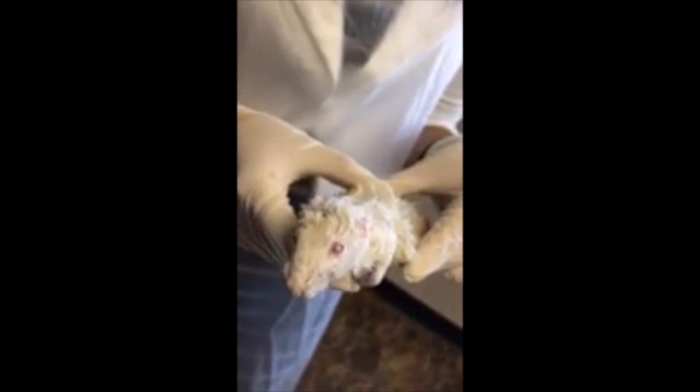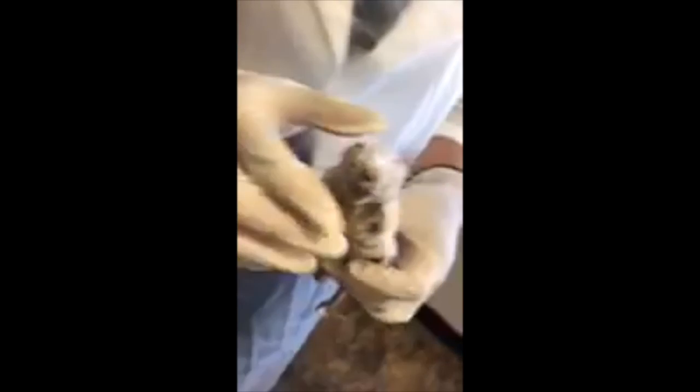Today we will be discussing the external functions of the rat. These are the vibrissae, also called whiskers, which is a sensory function which helps them judge the size of an opening they're about to pass. That is the nares, and nares is plural. It is the opening to the nasal cavity.